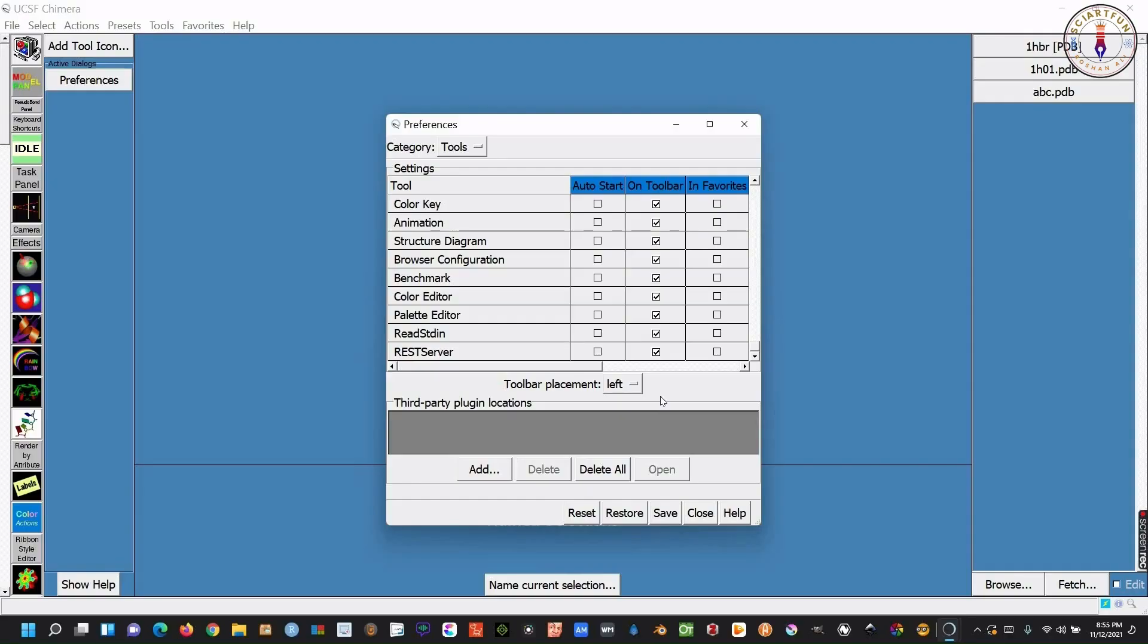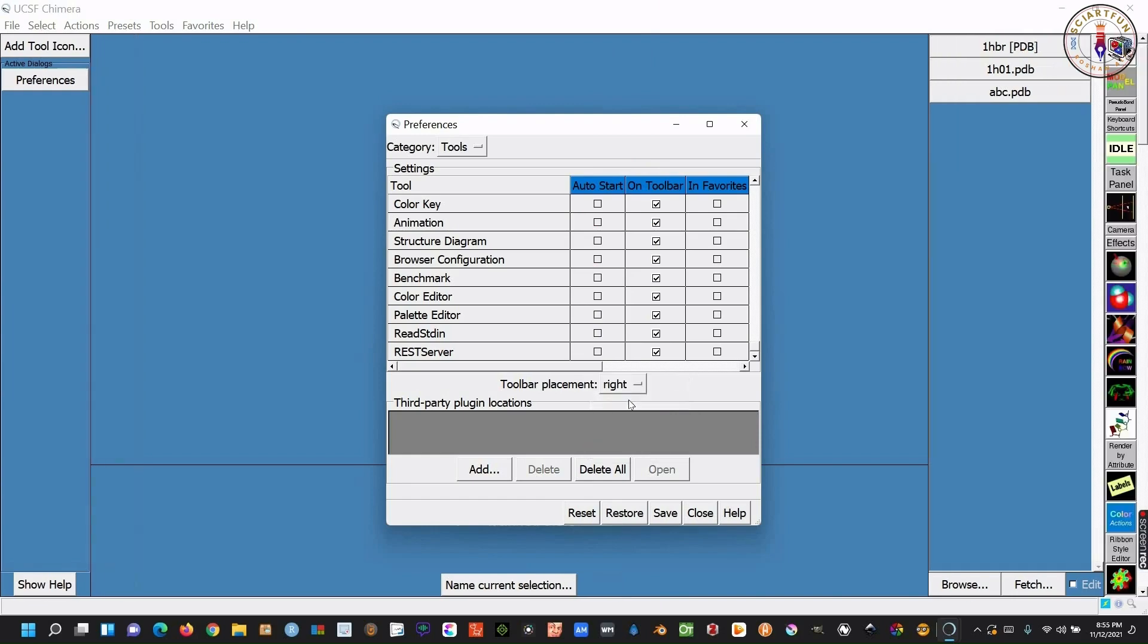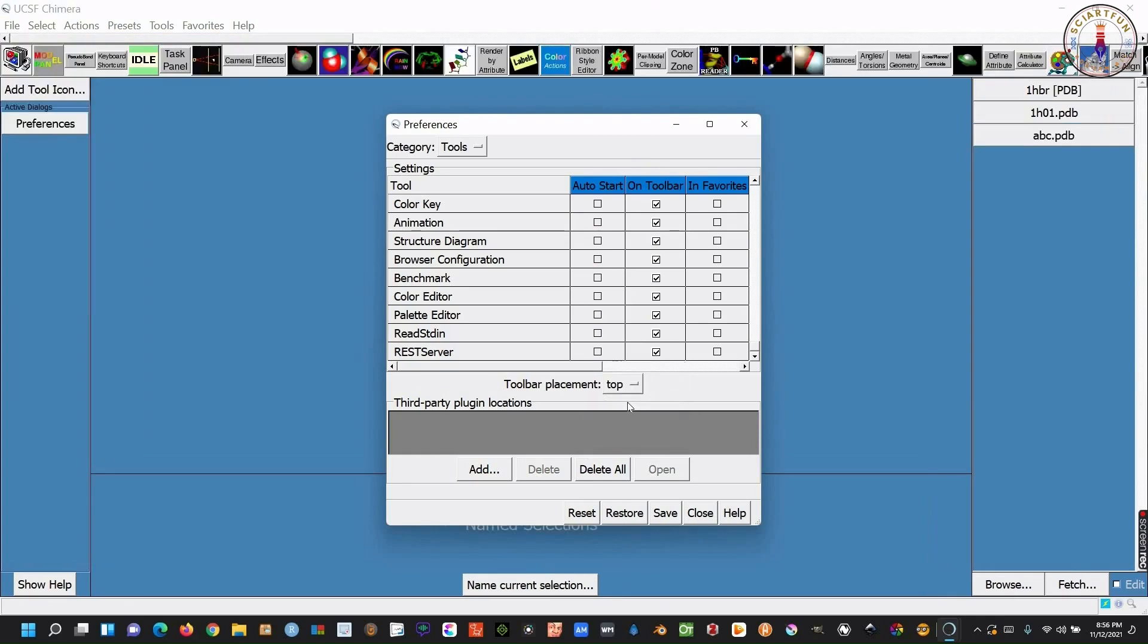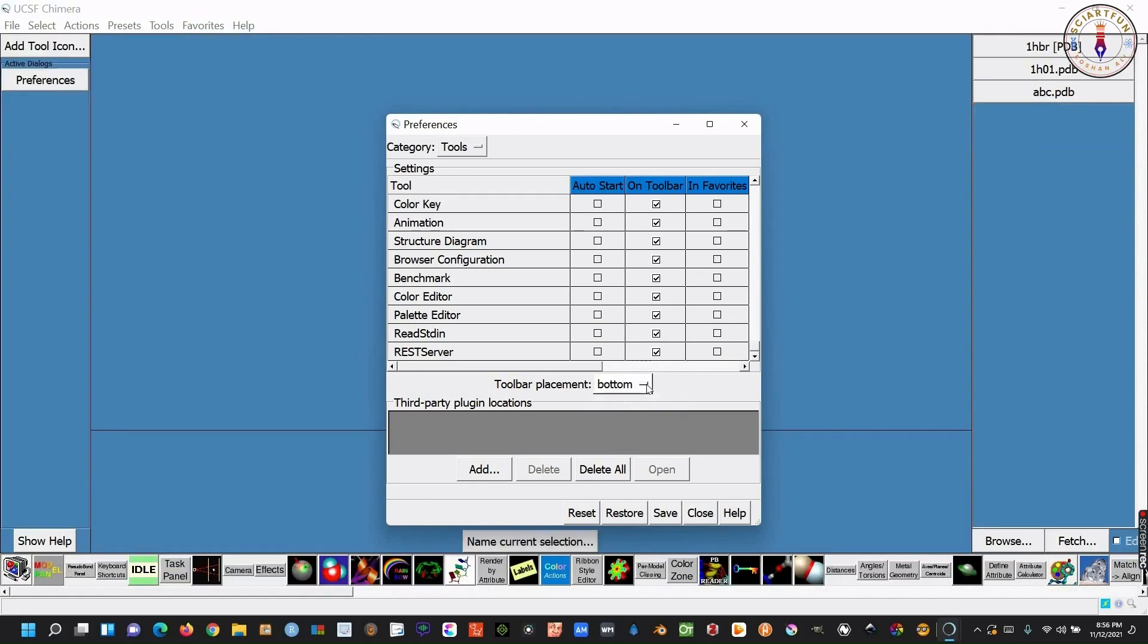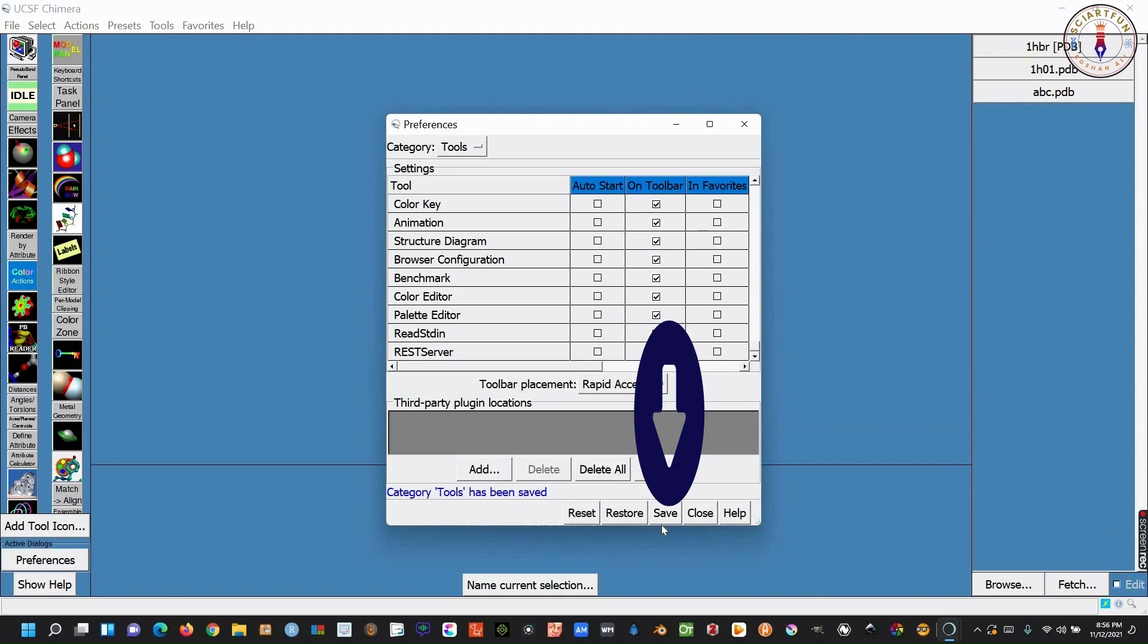Our next objective is to change the location of tools menu. Click this button in front of toolbar placement. Select right, top, or bottom, to show your tools menu at that position. This rapid access option will show most of the tools in the window, and you will not have to scroll down for more tools. After this, click save to save this configuration.